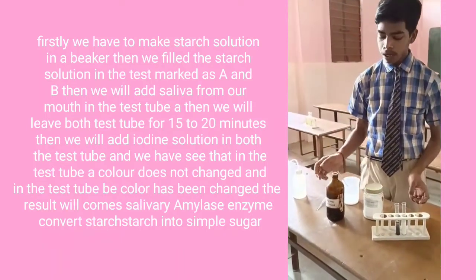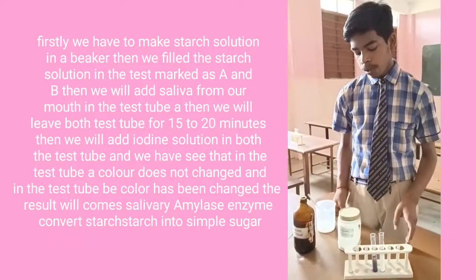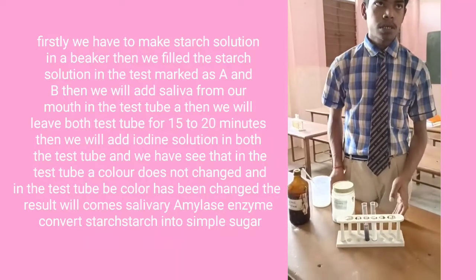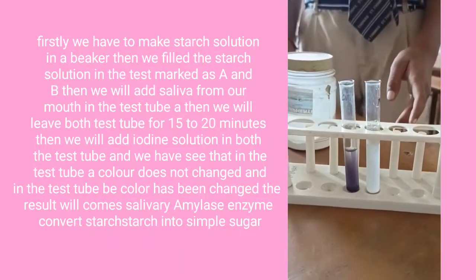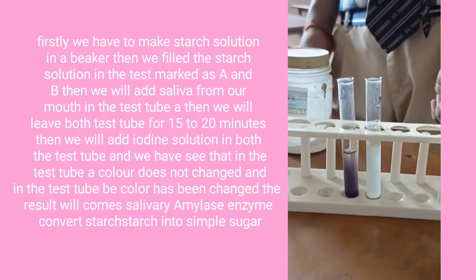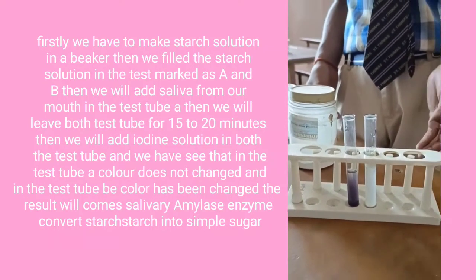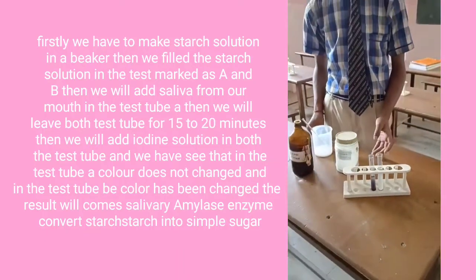Then we will add iodine solution in both test tubes, and we have seen that in test tube A color does not change, and in test tube B color has been changed. The result will come: salivary amylase enzyme converts starch into simple sugar.